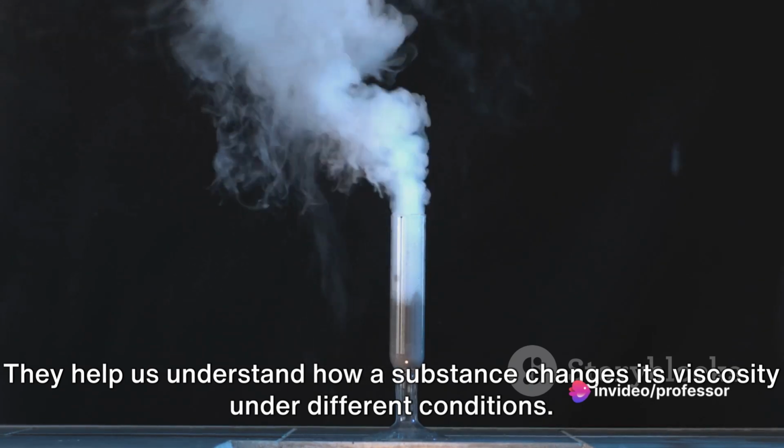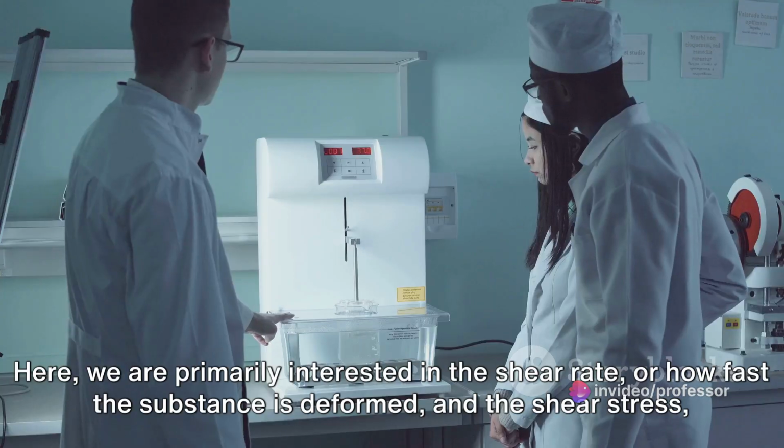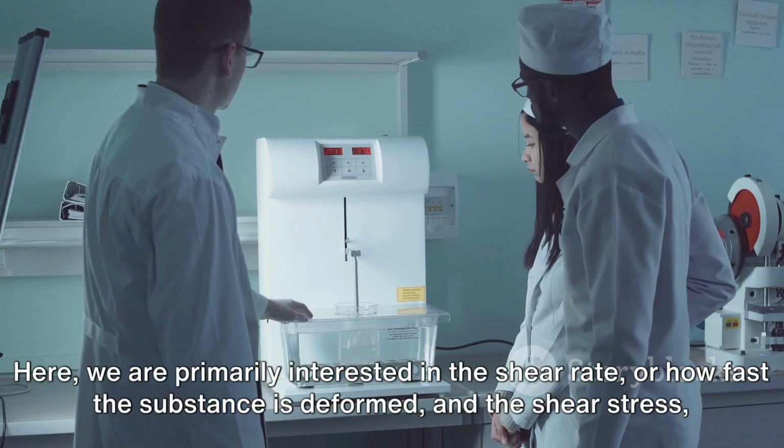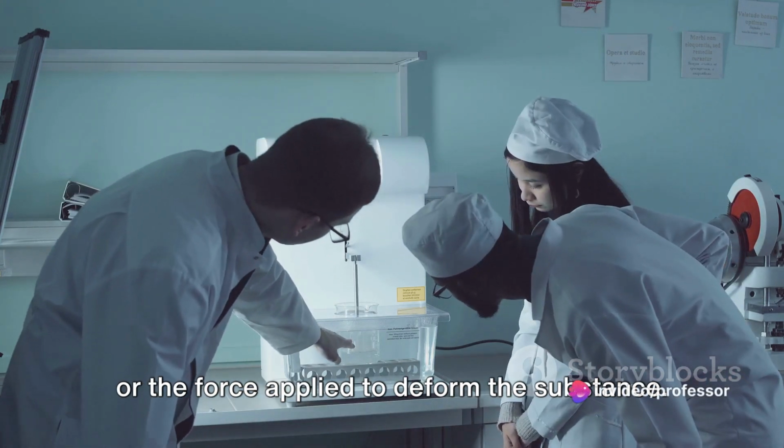They help us understand how a substance changes its viscosity under different conditions. Here we are primarily interested in the shear rate, or how fast the substance is deformed, and the shear stress, or the force applied to deform the substance.